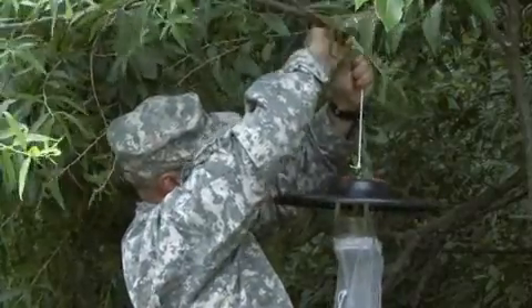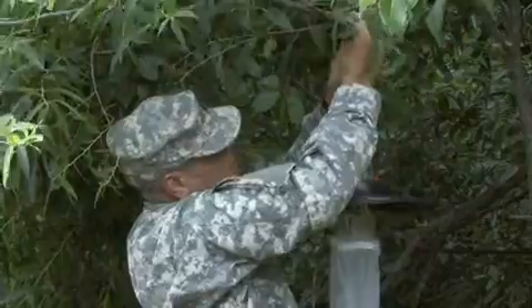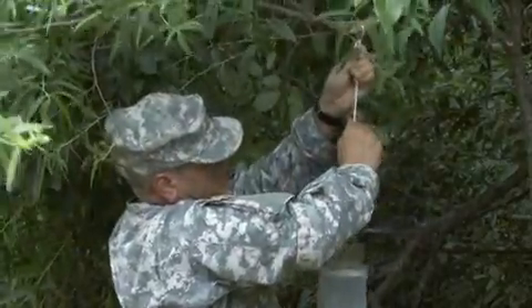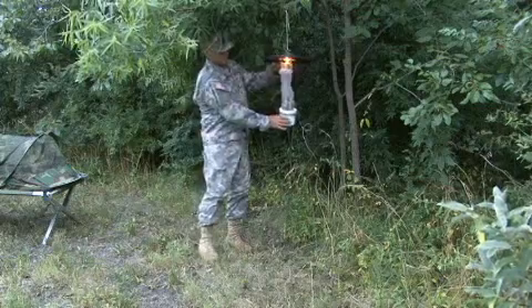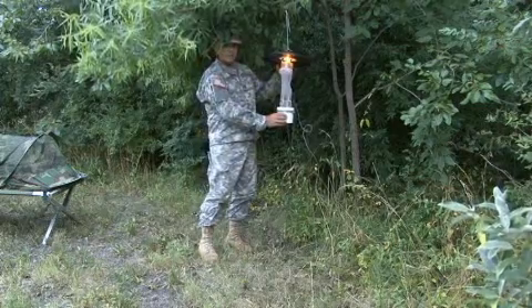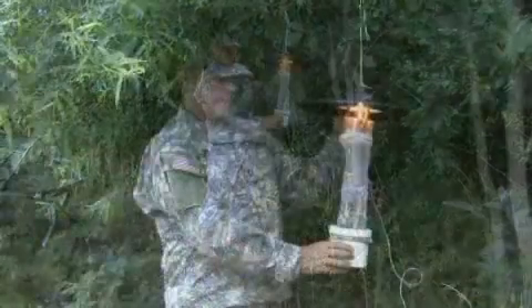The batteries used to run the light will usually last 1-2 nights before they need to be recharged or replaced. It is advisable to notify installation police of the location and purpose of the traps. After the light trap has been hung and is operating correctly, leave the light trap on overnight.